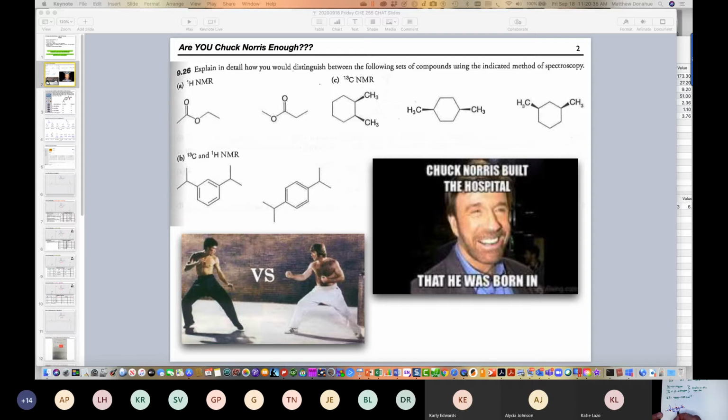Let's go back down this route. We went that way, let's go this way. We have an sp2 hybridized carbon with an H. I'm running out of shapes here, maybe I'll do an asterisk. Those mirror each other, that's 5. And then we're on the last one here. I'm going to use the dot again. So that's 6. So this one has 6 unique carbons.